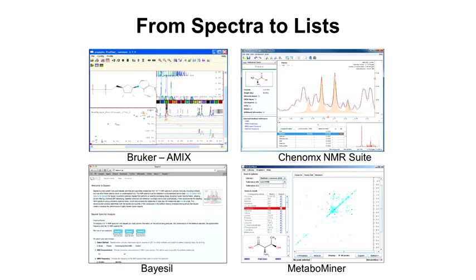It doesn't allow you to save anything, but you can keep on getting the download for free. It's now reduced in price and quite accessible. It has a huge library of many different frequencies, from 400 to I think 1.2 gigahertz at many different pHs. So it's got an exceptional library.